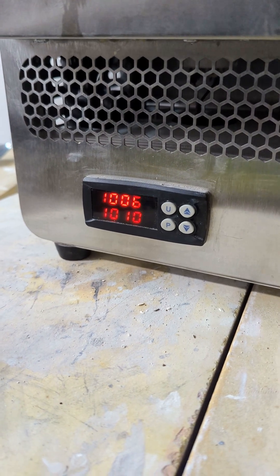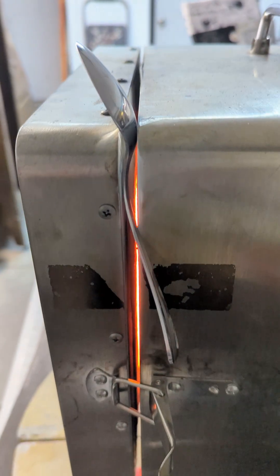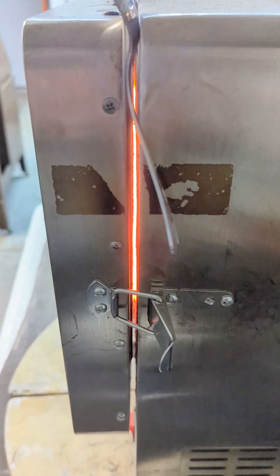Just about at temperature. I'll be cracking open the door shortly and turning on the fan. I'm at temperature. I have the door slightly propped open with a spoon.